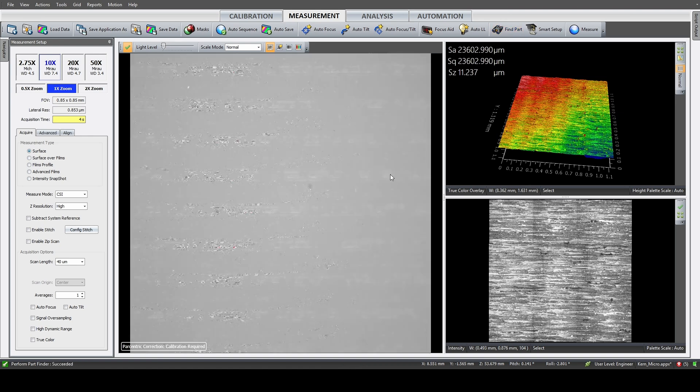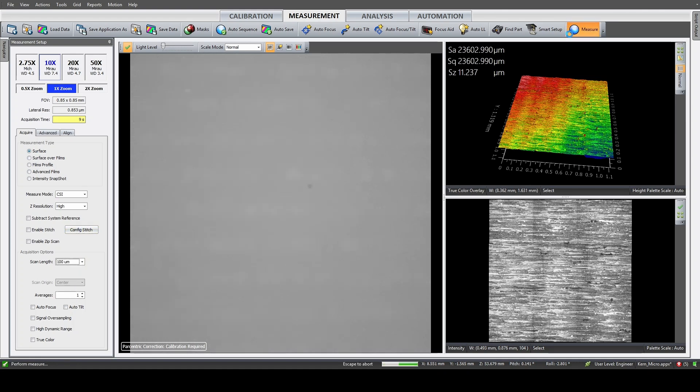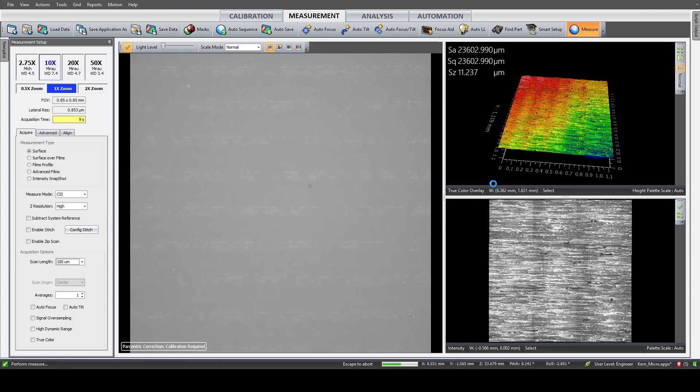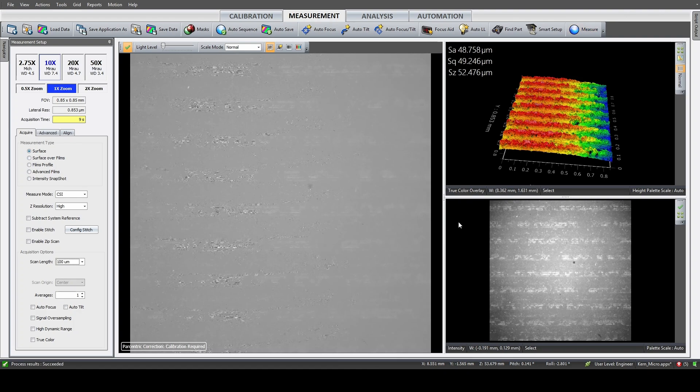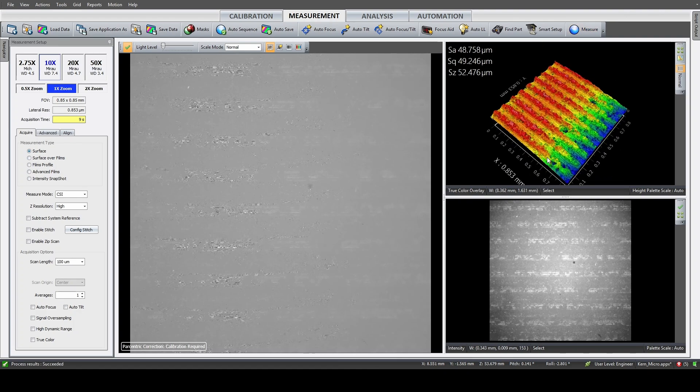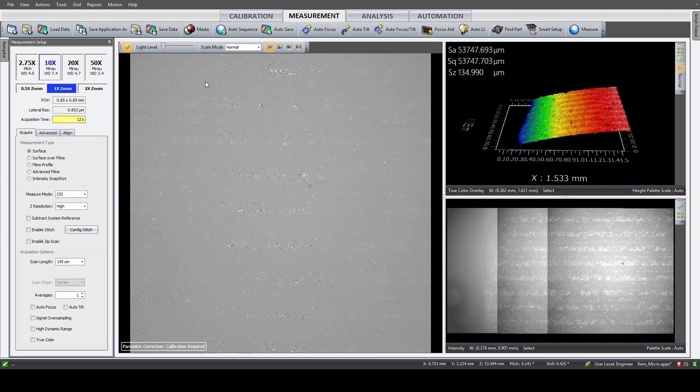The workflow of any optical measurement device is always pretty similar. Find the part, find the region of interest, and then adapt the illumination, magnification, measurement range in Z, but also the area you want to record. Zygon has their own software to operate the interferometer, which is equipped with handy functions like find part, auto tilt, auto focus, and auto illumination.